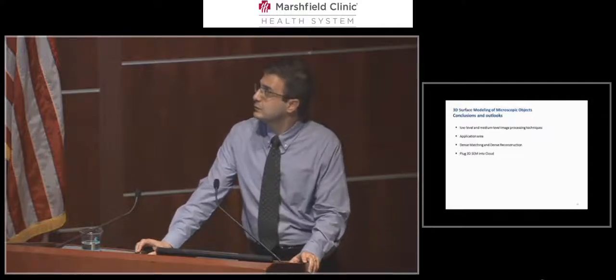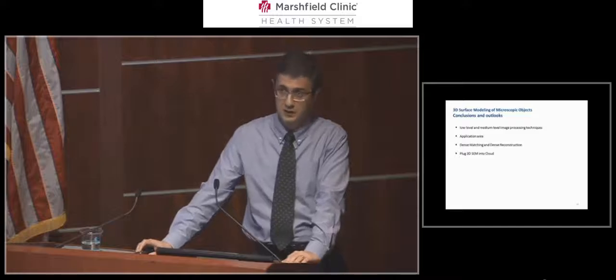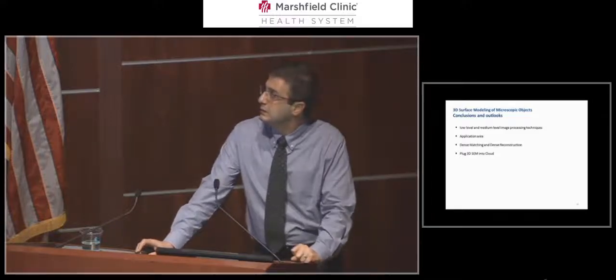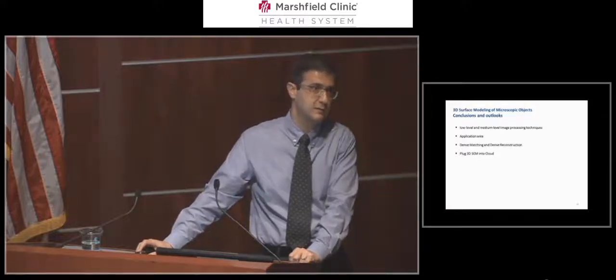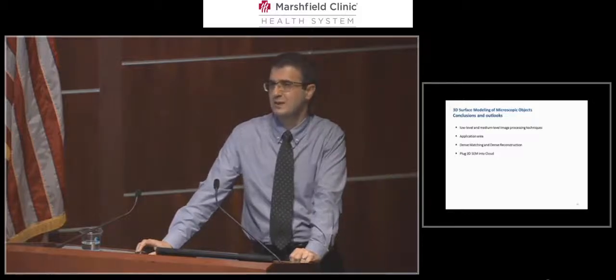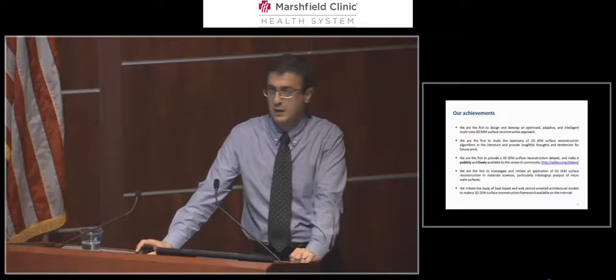We also need to work on dense matching instead of sparse matching, and dense reconstruction instead of sparse reconstruction. And we really would like to make our 3D SEM framework a plug-in and make it available to the research community across the world.